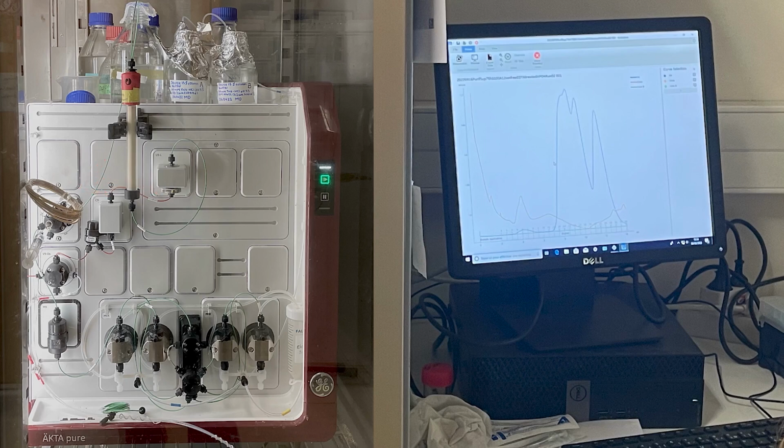The rest of the purification is then piloted from the computer with a dedicated software that allows to inject the sample from the loop onto the column and then perform the elution of the sample in the desired buffer. The absorbance at 280 nanometers, allowing to detect proteins eluting from the column, is monitored by a cell placed at the exit of the column, and the measurement is directly read on the chromatogram displayed on the computer screen.